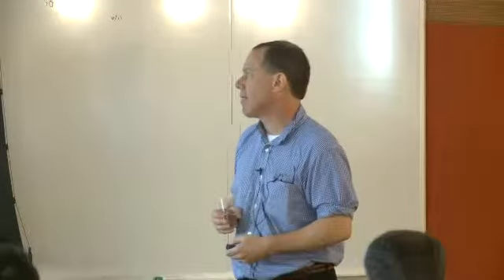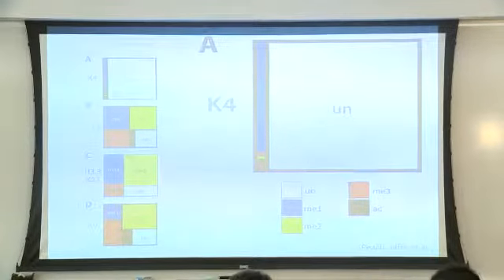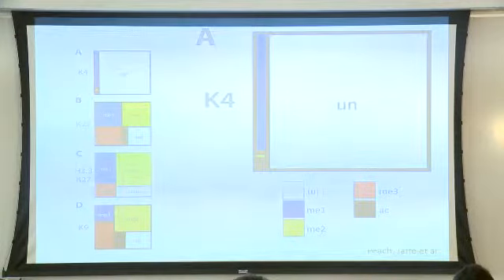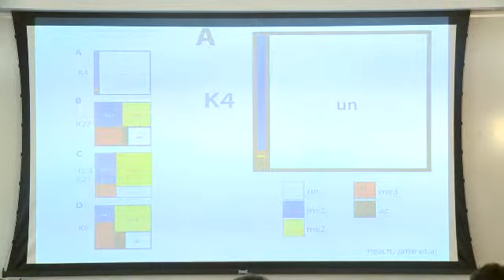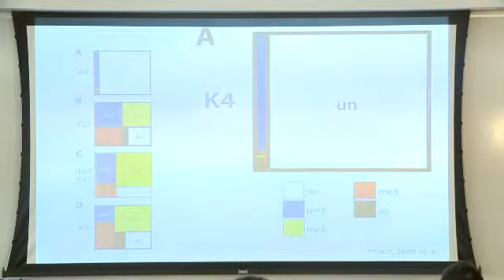So if you're using an antibody to trimethylated lysine 4 histone H3, hypothetically, which has a small propensity to interact with the monomethylated form, then even if it's a small tendency to cross-react from the perspective of the affinity of the reagent, the fact that this other modification is more abundant can lead to a significant degree of contamination in your signal.